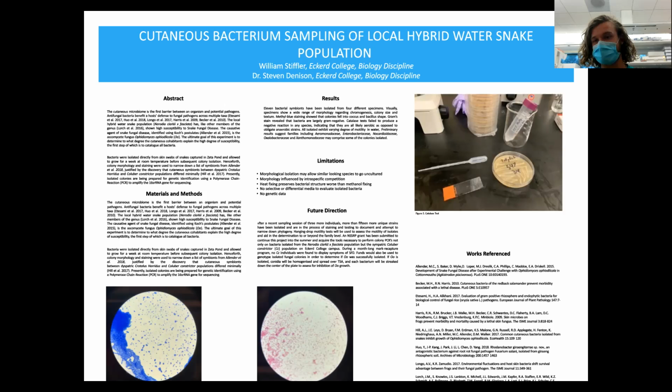Then there's a catalase test, which tells you whether the enzyme catalase is present inside of the bacterium. And finally, a motility test, which tells you whether the bacteria is motile, at least in water, the way that I performed it. Between all of these tests, I was able to tell what families I was working with, not necessarily to the genus.